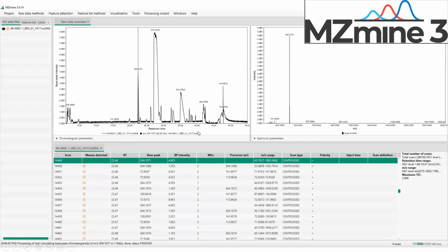All right, our data, essentially, I use MZmine 3 to process the data. What it is at the simplest level is just a sequence of MS1 scans or survey scans, and then fragment scans for particular so-called precursors, ions that are selected for fragmentation. The data is really a sequence of mass spectra, being one MS1 spectrum, then a bunch of MS2 spectra, and then again an MS1 spectrum, and then a bunch of MS2 spectra. So essentially, through MZmine we process this. We get two types of files.